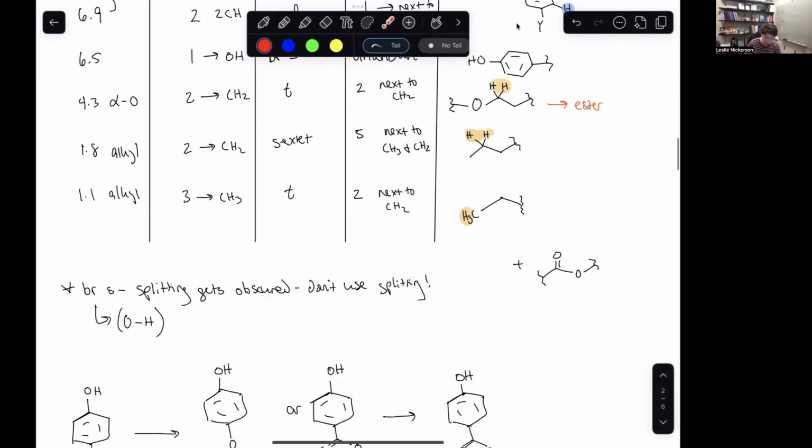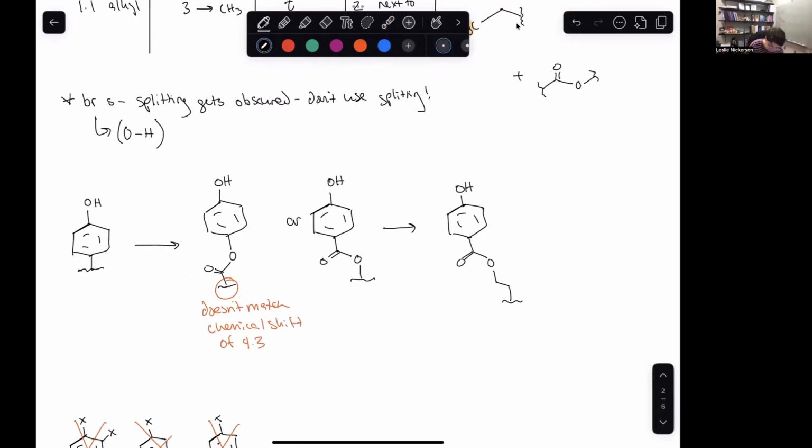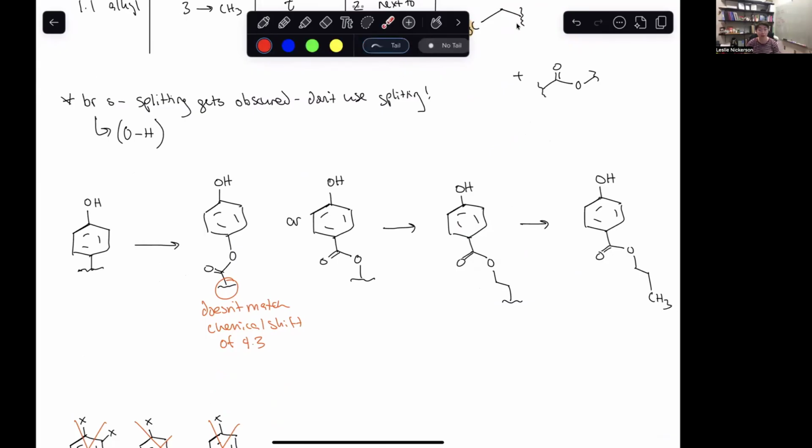If we're looking at this sequence of events, we've got CH2 and another CH2 and a CH3. So if I just make that last point a CH3, I have all the carbons that I need.